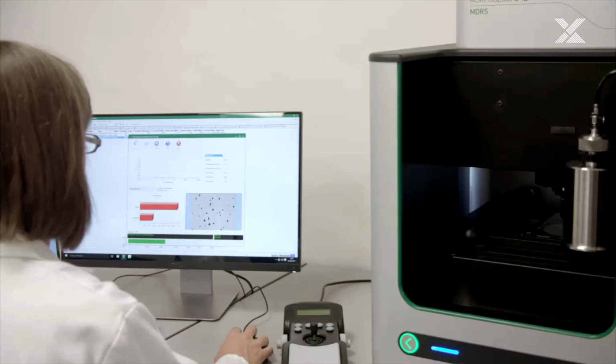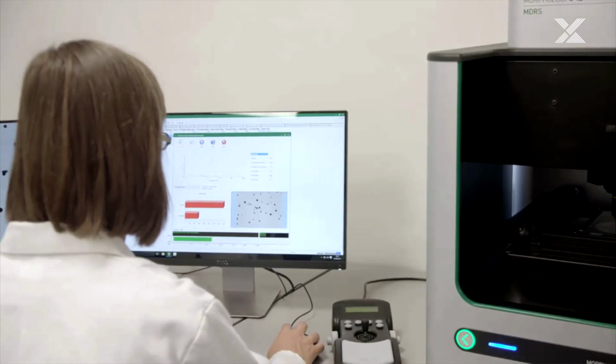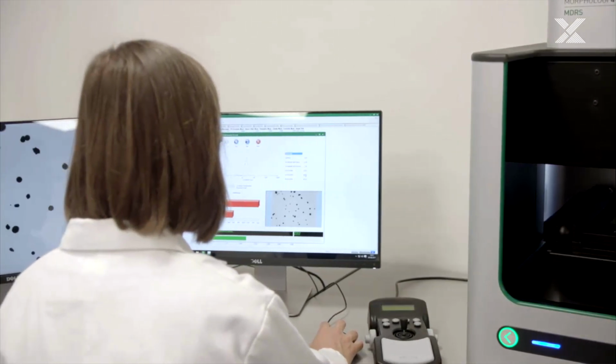Convexity is a very useful parameter for anything that's related to reaction rates, like dissolution. This is because a rough surface will have a higher surface area compared to a smooth one. So if you had two particles of the same size, if one has lower convexity, then it's more likely to dissolve more quickly.